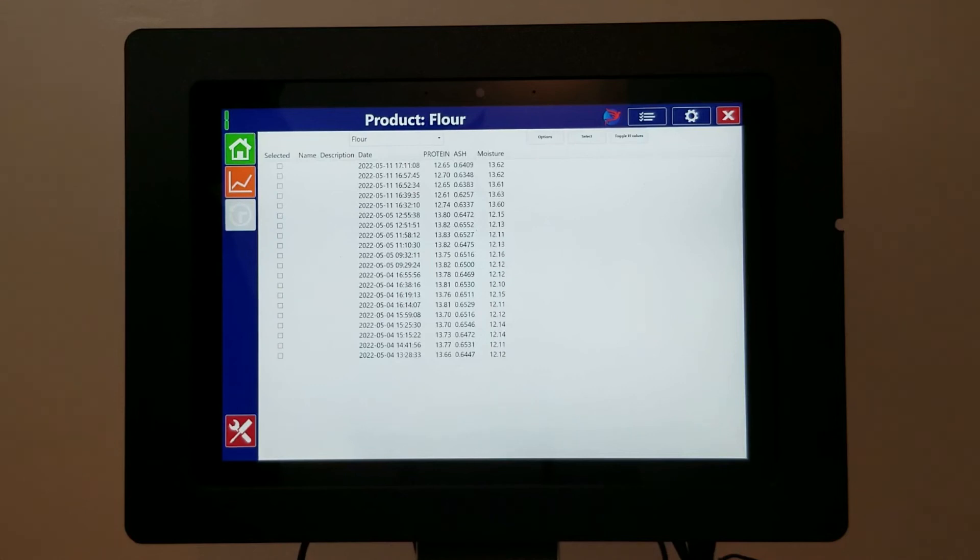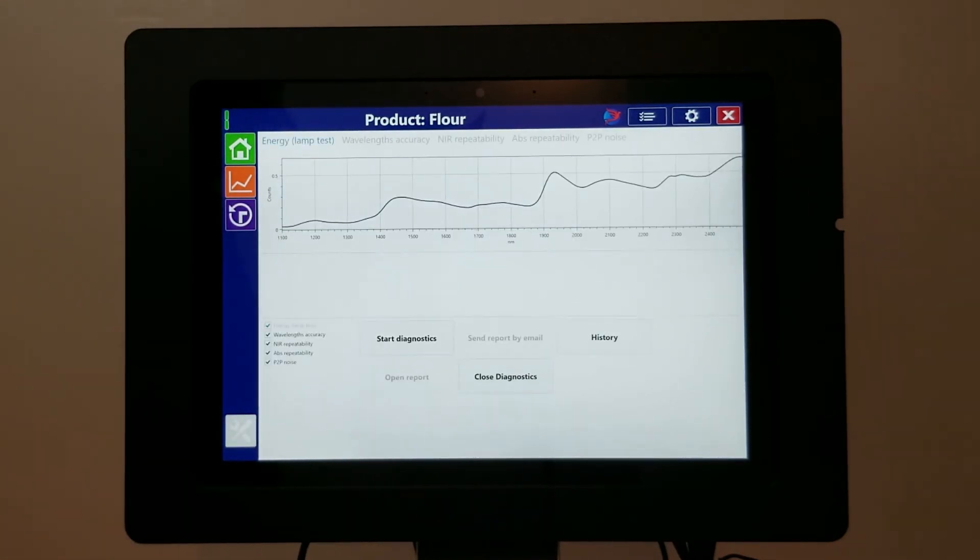The History tab, where you can view the results of previous scans. And the Diagnostics tab, where you can perform routine diagnostic functions.